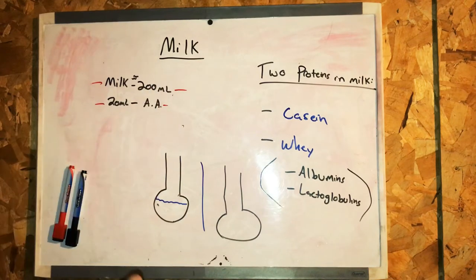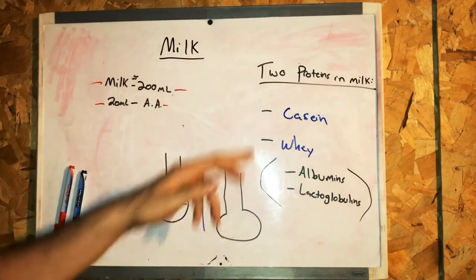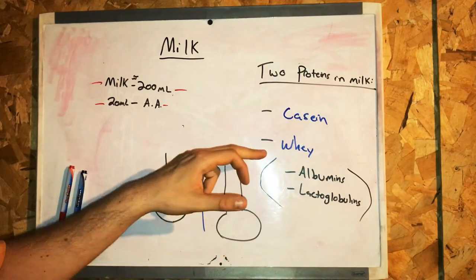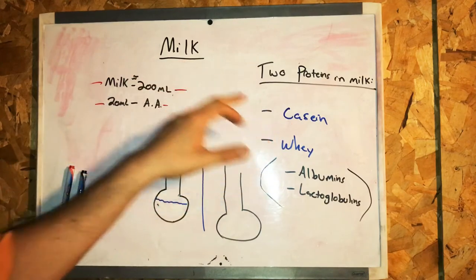I'm working with milk in the laboratory. There are two proteins in milk: casein and whey. I'm going to extract the casein from the milk.